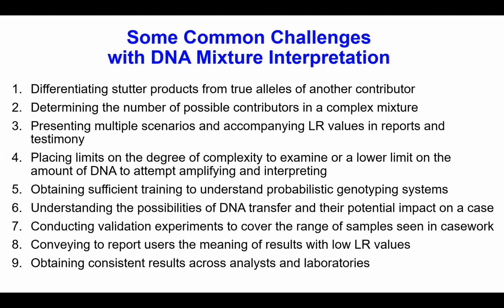What types of validation experiments should be done to cover the range of samples that may be seen in casework? How do you convey to report users the meaning of those results, often when you have a very low LR, a likelihood ratio value? What does that actually mean, and how do you convey it? And then finally, the challenge of obtaining consistent results across analysts and laboratories.